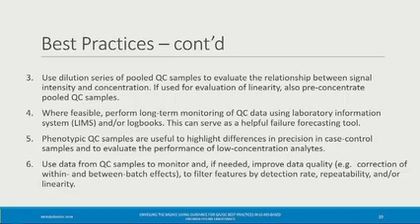No, this is an excellent point, and yes, you can vary injection volume and look at that. We can revise the guidance to reflect that as well. In terms of pre-concentration, there is a nice study by Matt Lewis. If you talk to me afterwards, I can point you to the paper where they actually also pre-concentrated pooled QC samples and then did dilution series.